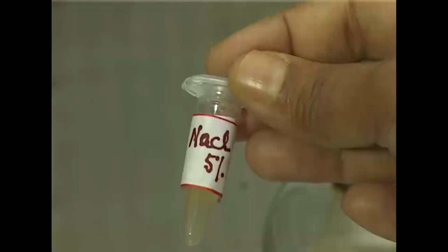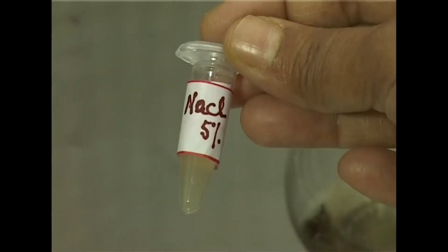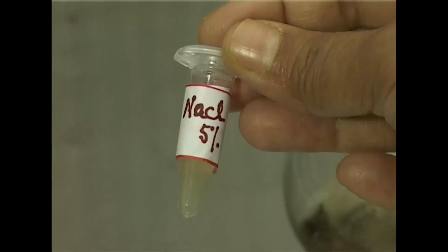If you have different isolates which can be designated as C1, C2, they will show differential growth character, but you cannot observe growth at 10-15 degrees centigrade, and you will observe the optimum or maximum growth at 30 degrees centigrade. And interestingly, it is observed that it can tolerate sodium chloride up to 5%. You cannot observe any growth for any of the isolates at 6.5% as well.